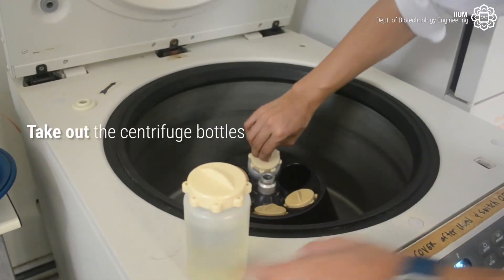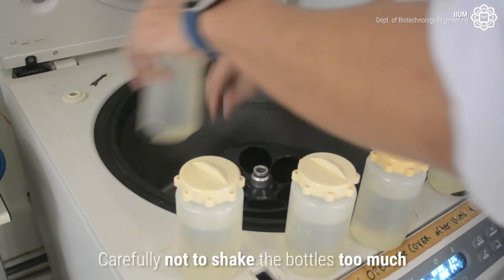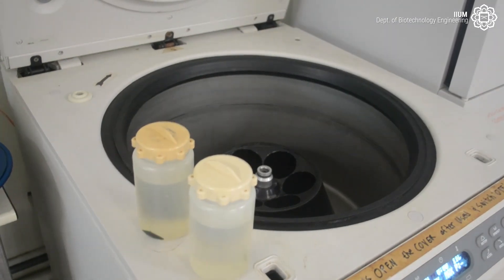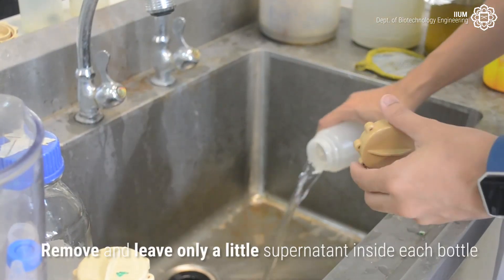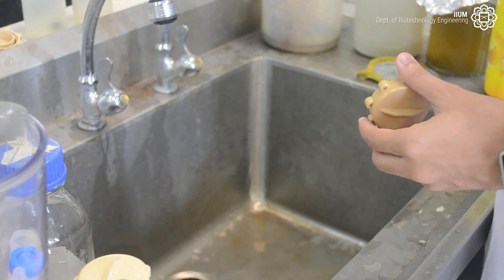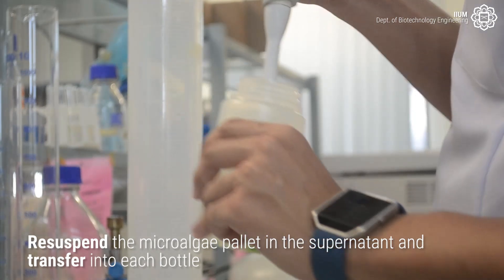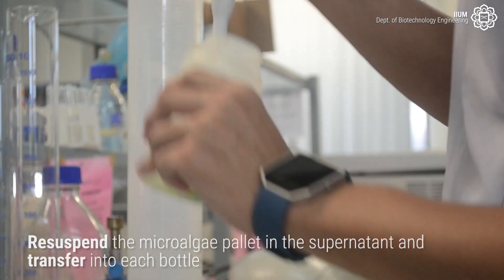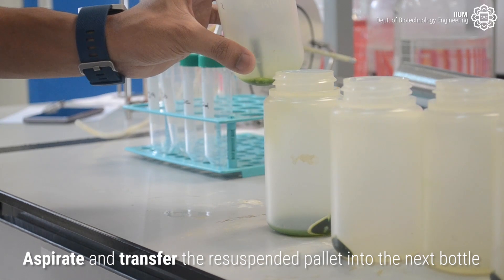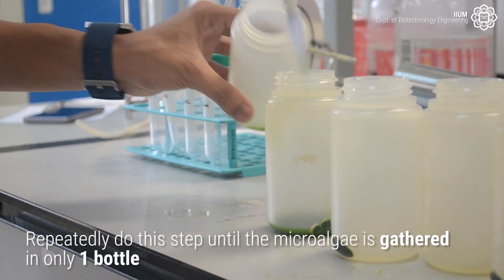Get the centrifuge bottles out of the centrifuges. Be careful not to shake the bottles too much. Remove the supernatant, leaving only a little inside each bottle. Re-suspend the microalgae pellet in the supernatant and transfer into each bottle. Aspirate and transfer the re-suspended pellet into the next bottle. Repeatedly do this step until the microalgae is gathered in only one bottle.